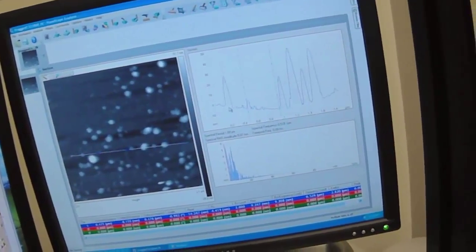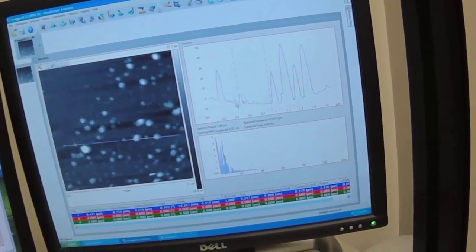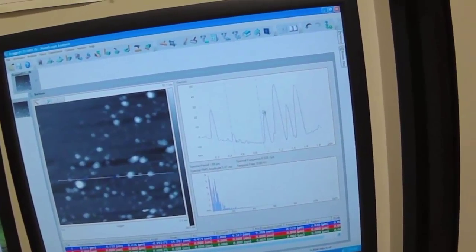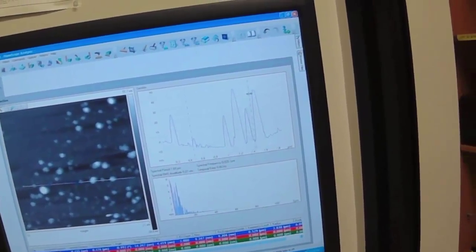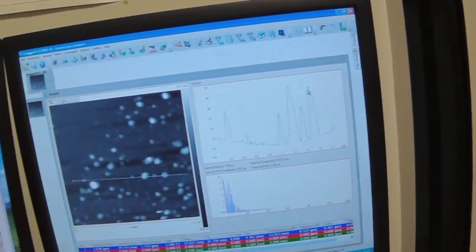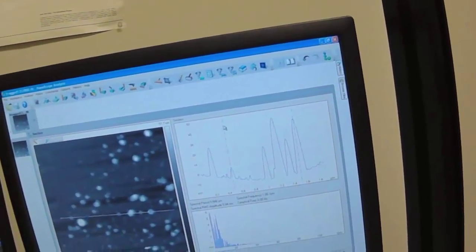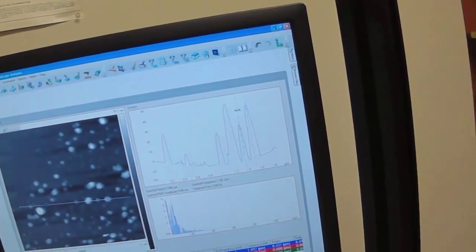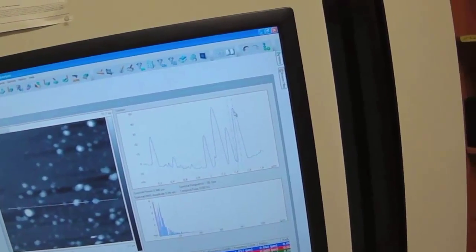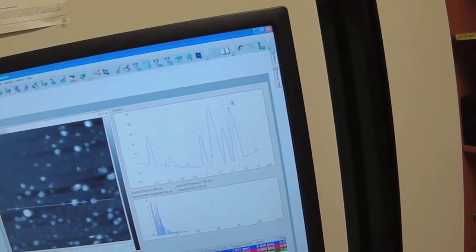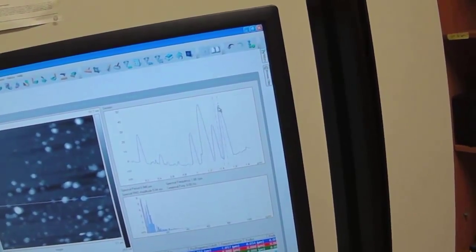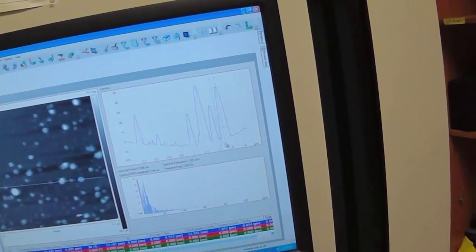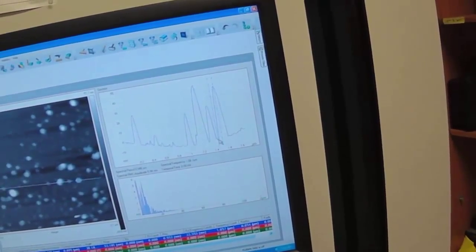Here's our profile. We see actually our background wasn't quite flattened out, but that's okay. We can move these cursors here. So let's say I want to know how high is this peak. So I put one cursor lined up with the top of the peak, one cursor lined up with the base of the peak.